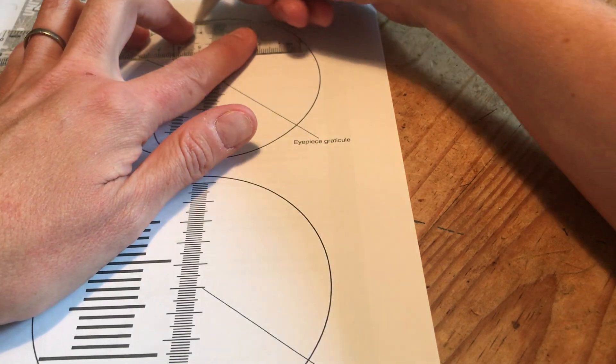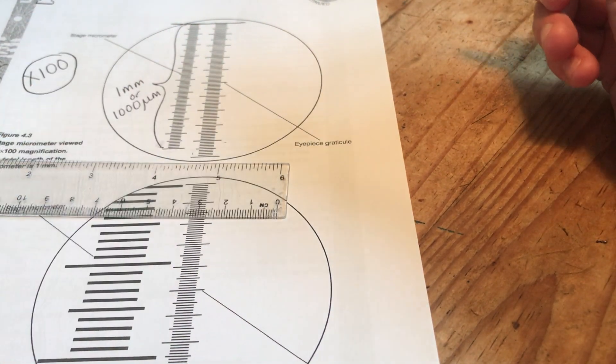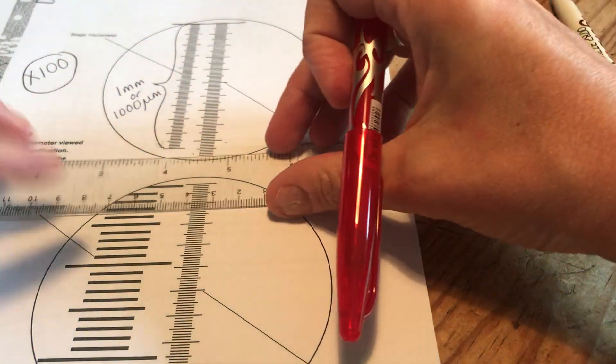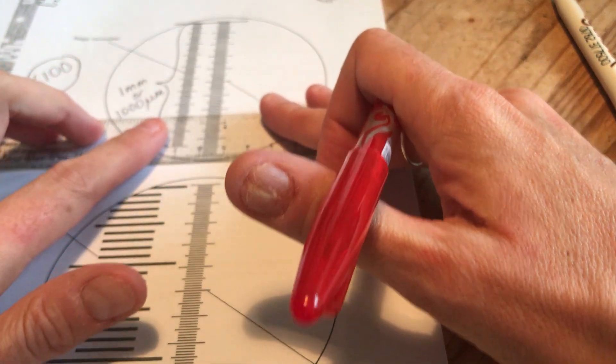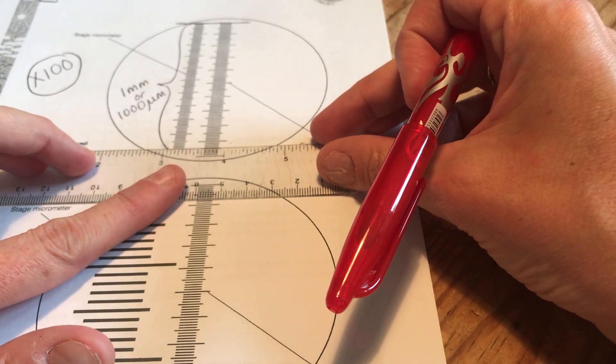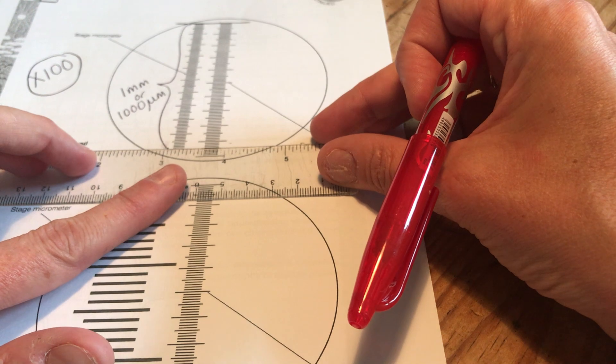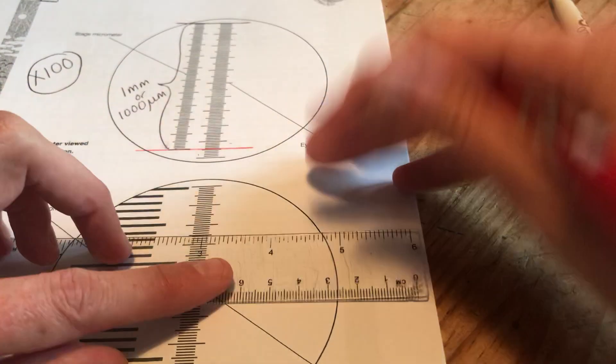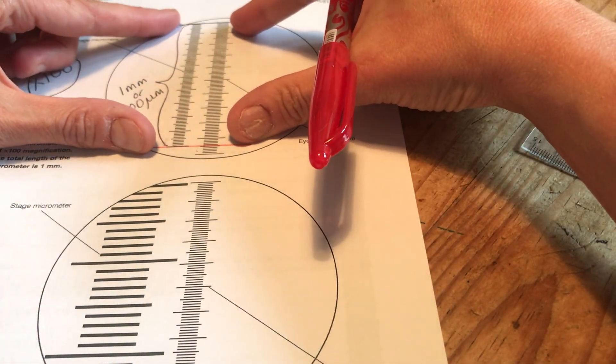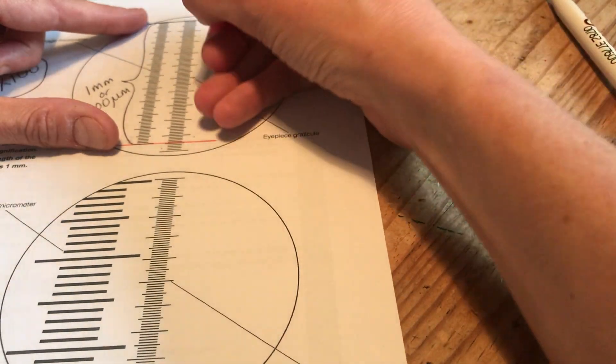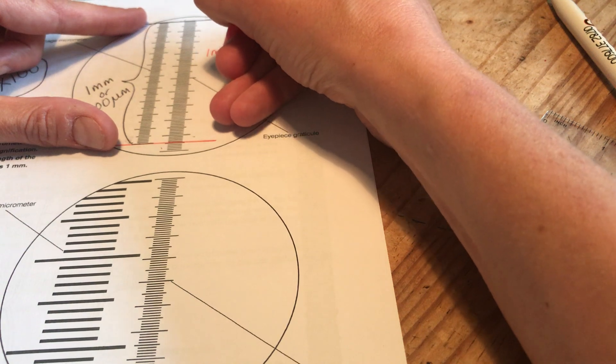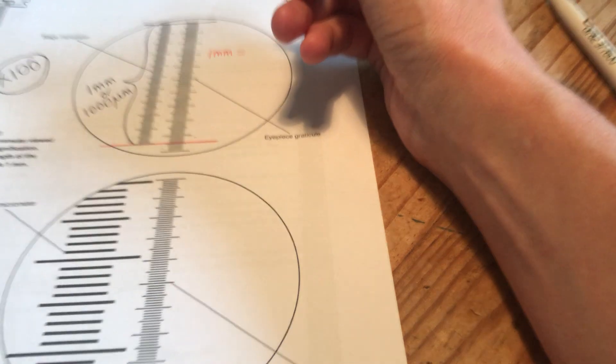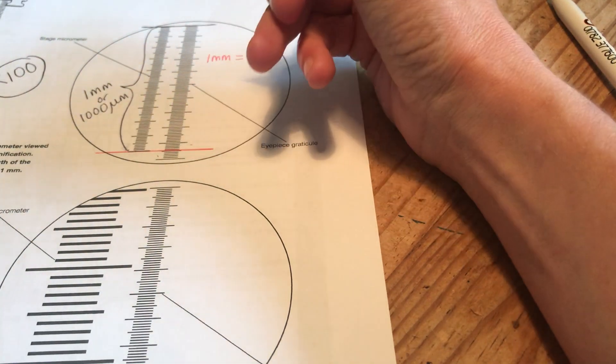So for instance these two lines line up really nicely here. I might use a red pen to help you see this a bit better. I could pick any point where the lines line up nicely but I'm going to go just at the end here. They don't line up perfectly so you're going to get a little bit of error. But can you see I've lined up these two scales. Now I know that one millimeter in real life is equal to, if I add up how many lines I can see here.